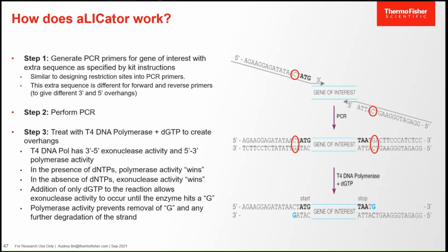equilibrate at the first occurrence of the cytosine in the complementary strand, which means when there is a C in the template, then the dGTP will act, so it will put in the dGTP, so the polymerase activity will restore the dGTP here. With this, it will generate a long complementary sticky end, which ends with a G.